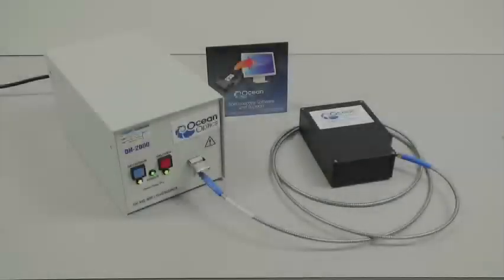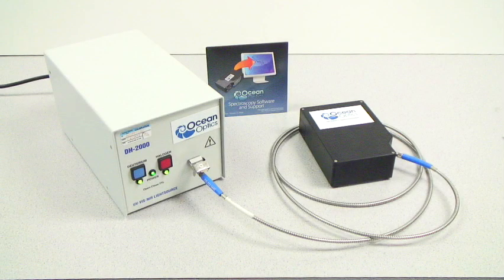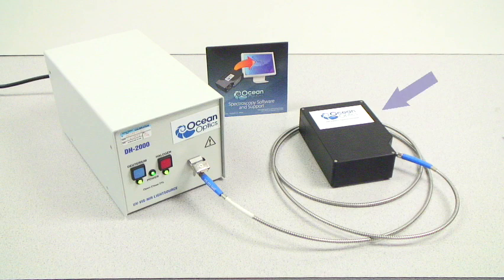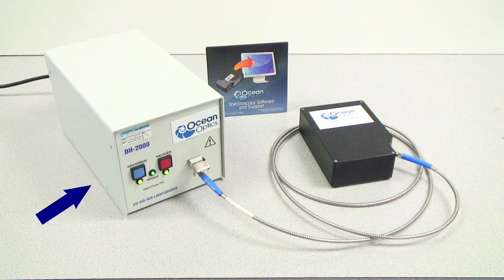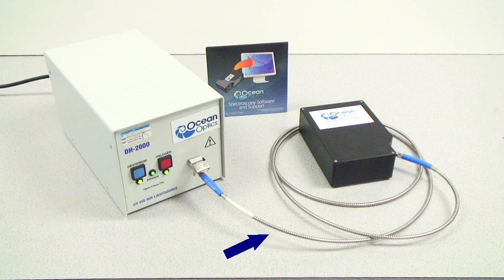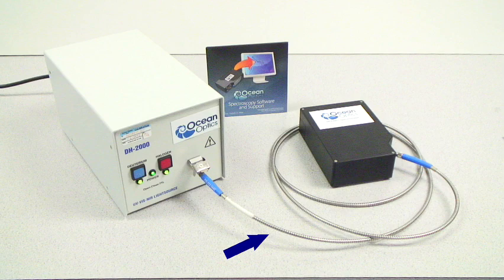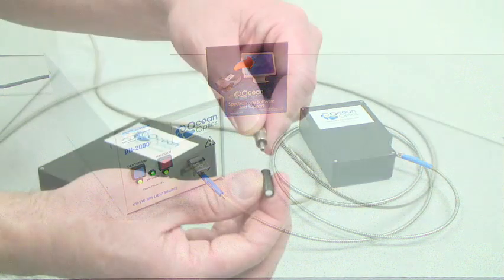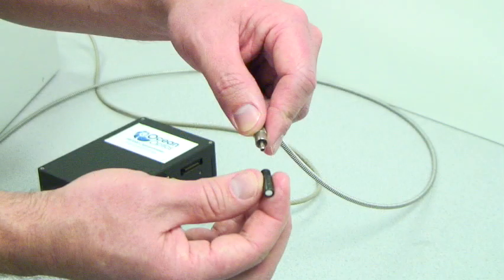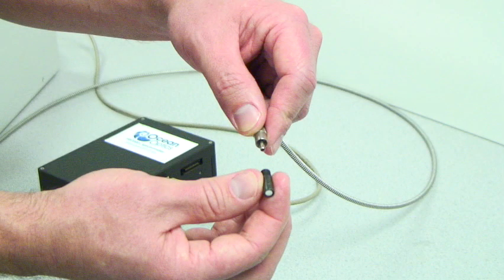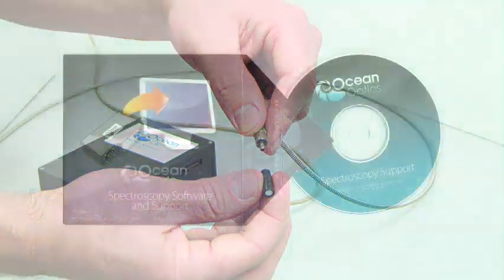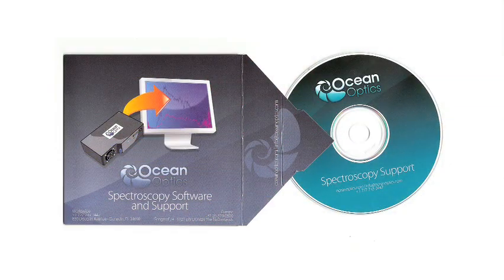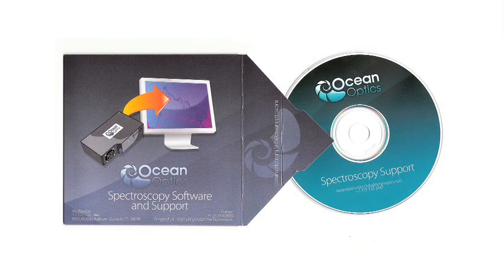For performing this calibration, we'll use an HR2000 plus CG spectrometer, a DH2000 cal calibrated light source, a 1000 micron UV vis fiber optic patch cable, a CC3 UV cosine corrector, and Spectra Suite software from Ocean Optics.